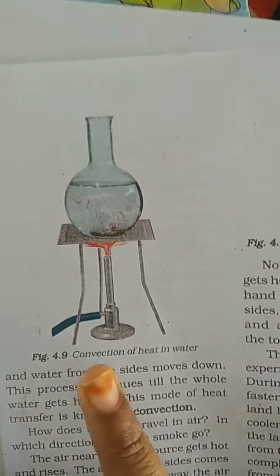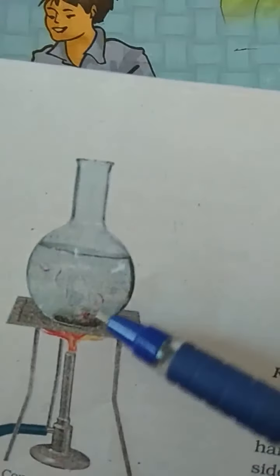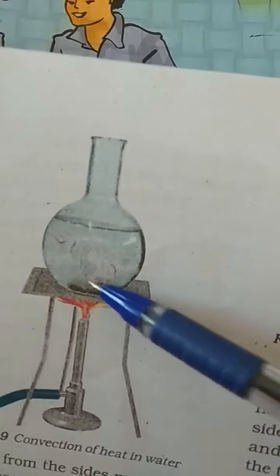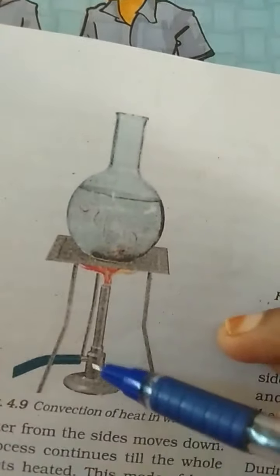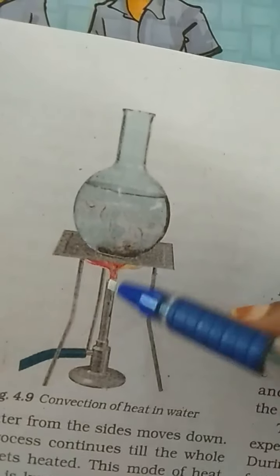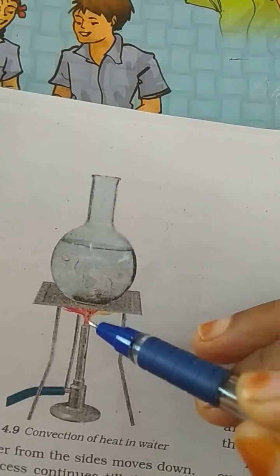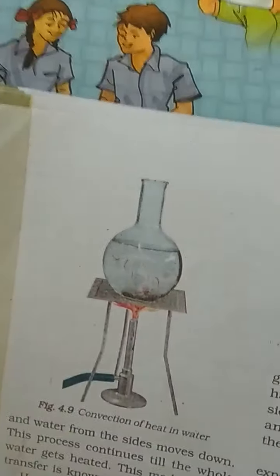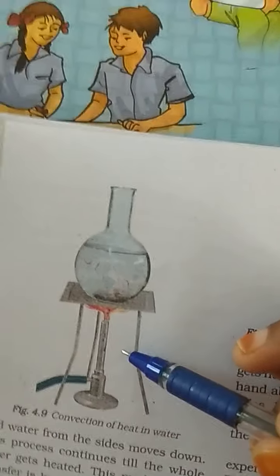Wait until the water in the flask is still. Place a crystal of potassium permanganate at the bottom of the flask gently through a straw. Now we have to heat with a candle just below the crystal. Observe what happens here, and write it in your notebook.